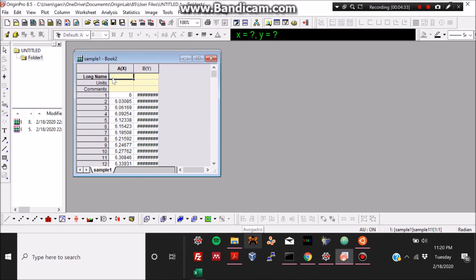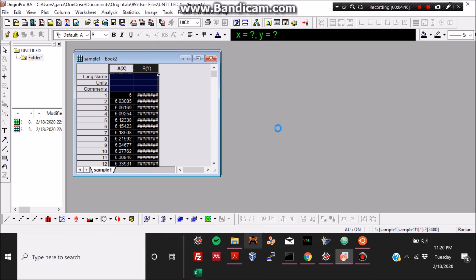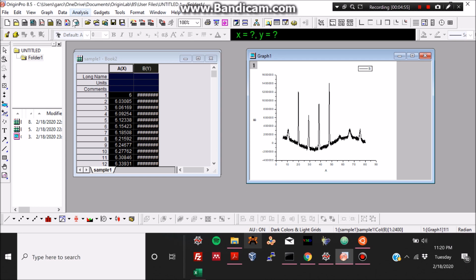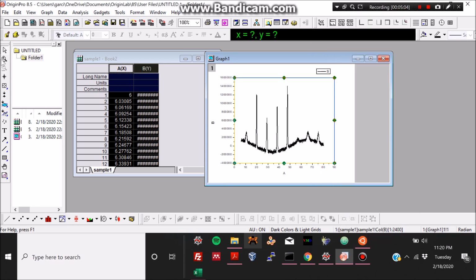Oh yeah. That's it. So let's say that you also want to do this in Origin Pro. I'll just show you really quickly how to do it. I've pre-selected the sample 1 data that you've already seen, right? And what we do is we go to plot, we plot it as a line plot. So after we plot it as a line plot, then we close in on the peak that we're interested in fitting.